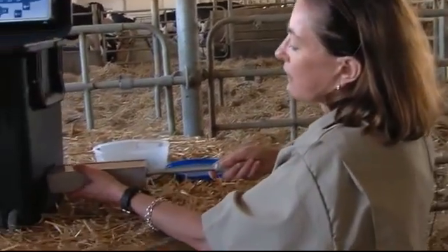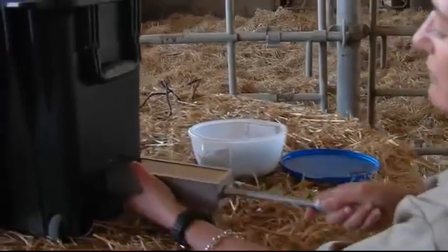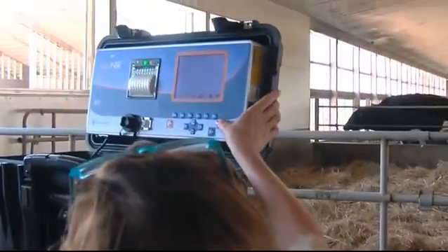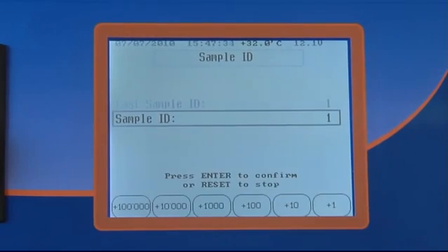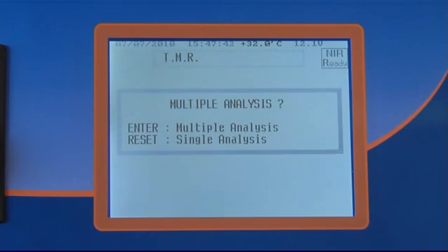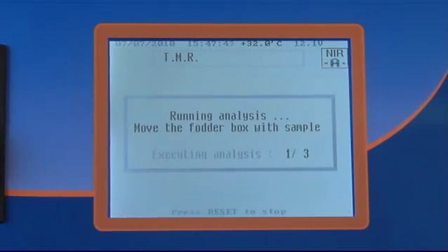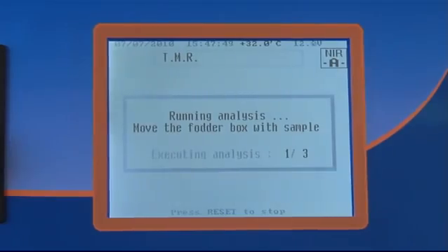I insert the rod into the NIR machine. I press enter. It asks me for the ID on my product. I'm going to put it down to example number one. Enter. Multiple analysis always. And then I start to pass it through the NIR eye.